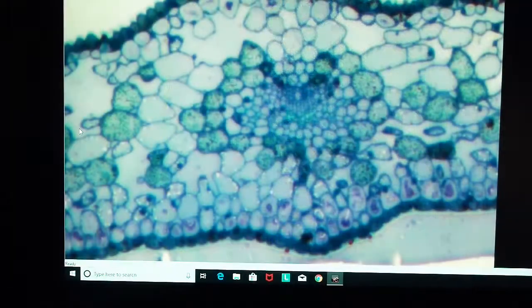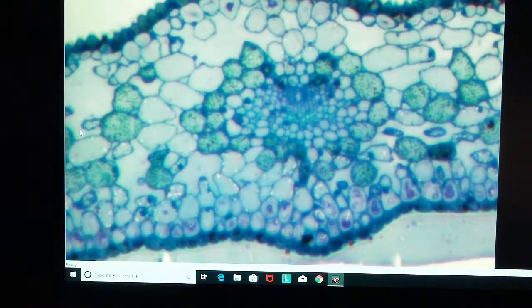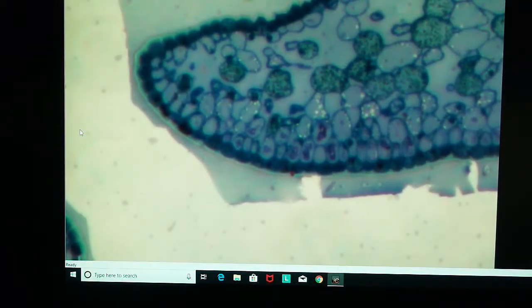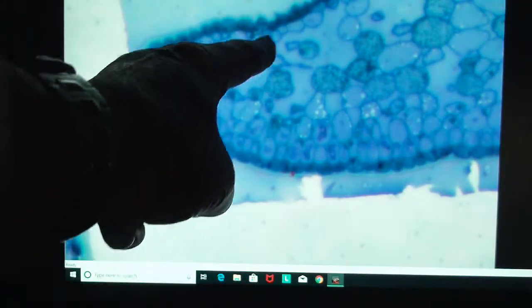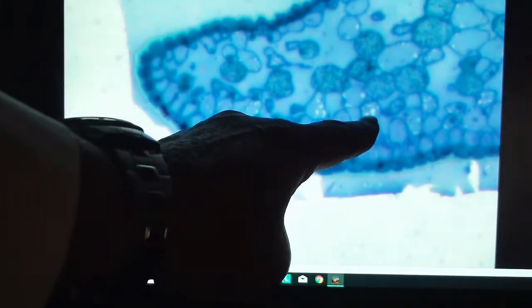Now, here is the euonymus and this again has that waxy coating. And it could have been run with the ethanol. As I look at this, the block face looks pretty good. Some of the upper epithelium does show some pinhole pricks. This is a millimeter and a half and so we'll see what the thick section looks like. And overall, it looks pretty good. But I can see here where the chloroplasts are, which generally have starch in them, which are difficult to infiltrate. They have small holes, pinholes within the section. So some of that tissue is not perfectly done. So that's a little bit concerning.